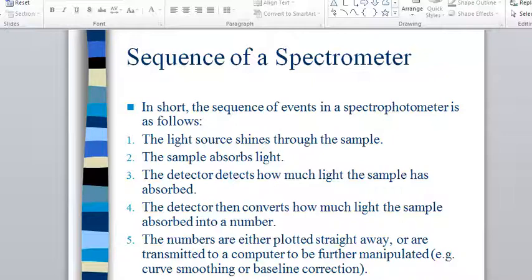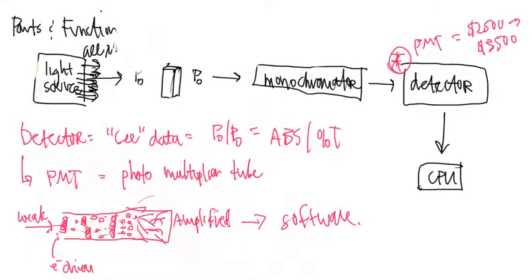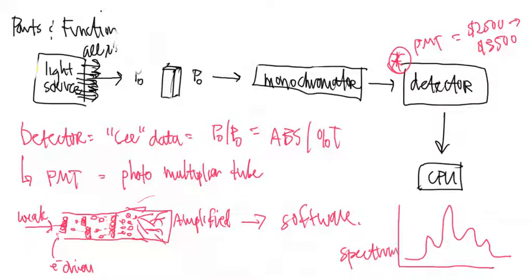All right. What I see on the screen is what we call a spectrum. On my screen itself, I will see maybe a couple of humps depending on what type of compound I'm using. I can take the spectrum of a molecule, and that allows me to find the tallest peak, which we call the lambda max.